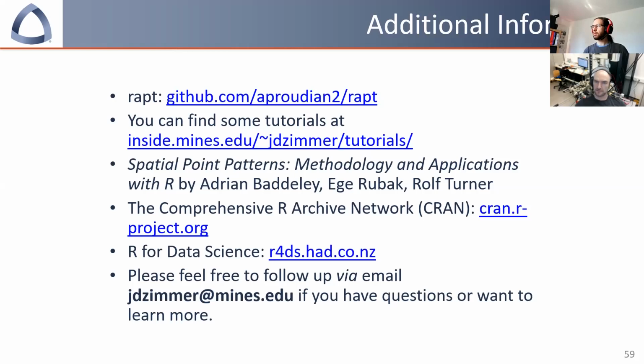Yeah, so I think we really need to be taking advantage of all the data that exists in our atom probe data sets. So far, we've been segmented into either mass spectral processing, spatial data processing, or multiple hit processing. I think there's a really rich data environment that allows us to combine those elements together and discover higher order correlations between all these different things. That's what we're starting to do here with this clustering analysis, where we have much more formal and rigorous tools to test for clustering.